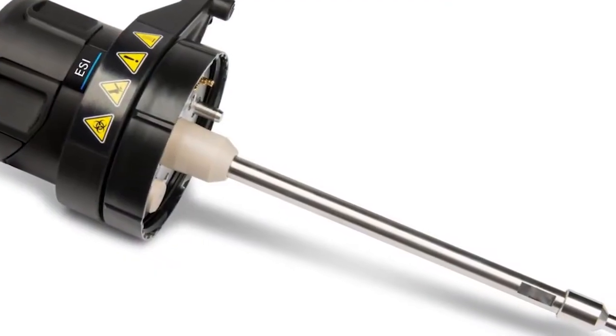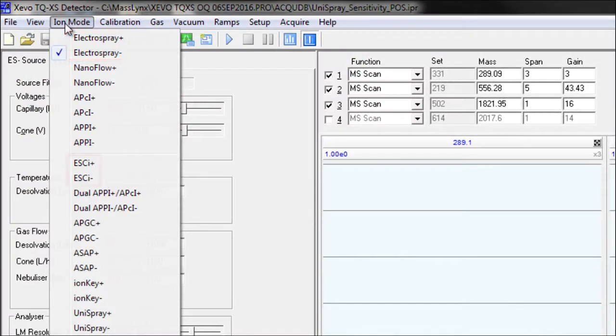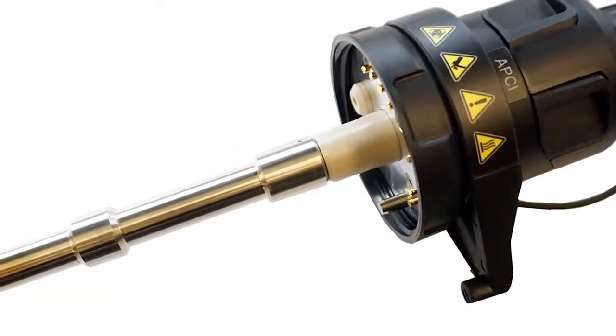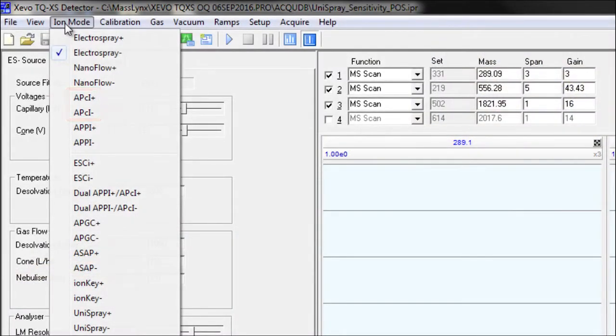The tool-free ESI probe supports ESI and ESCI operation, and the tool-free APCI probe supports APCI and APPI operation.